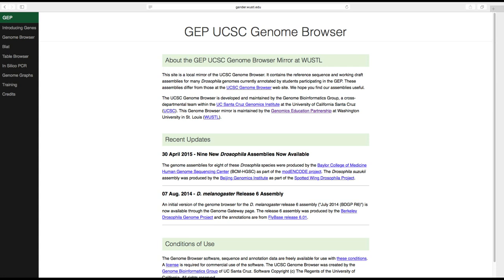The genome browser works similarly for genome sequences. The genome browser we are using allows us to view the genome assemblies of Drosophila or fruit fly species, although our work for these modules will be focused on Drosophila melanogaster, the most commonly used species in the laboratory.